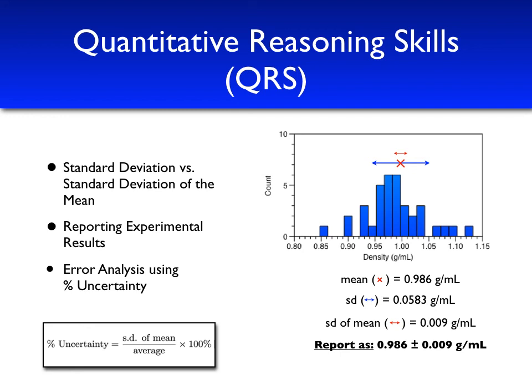After choosing that percent uncertainty, you can use the equation in your report pages to calculate a more absolute uncertainty, or a standard deviation of the mean, for your mass percent of copper glycinate.